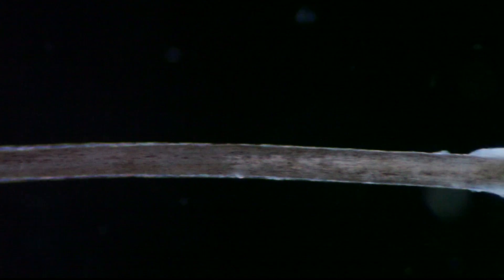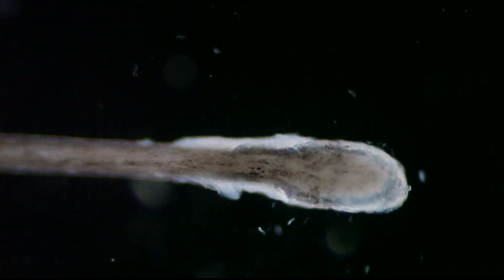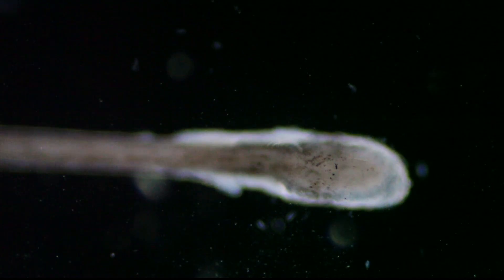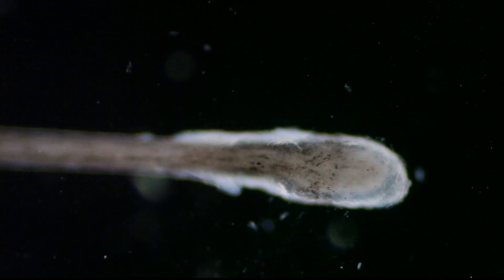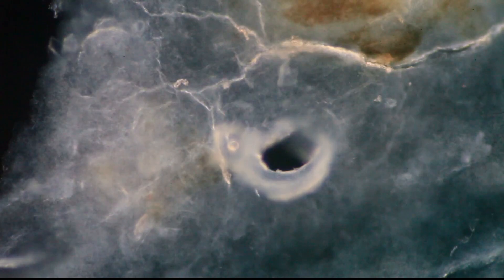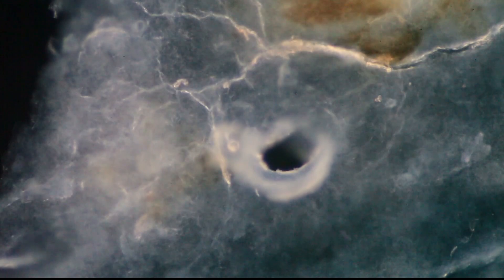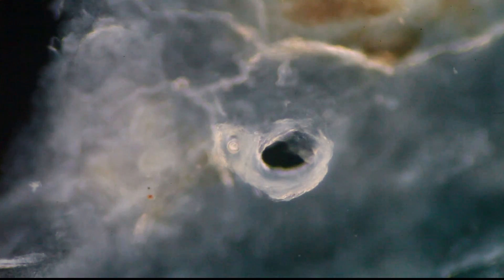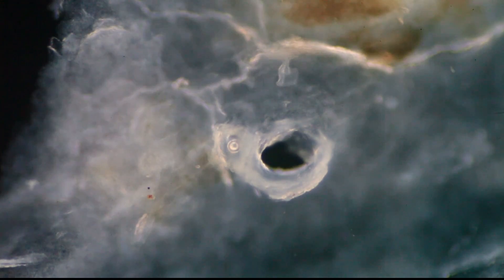Here is another hair, and this bulb-like structure is the hair root. Here is a little hole in a dandruff flake — this is where one of the hairs started to emerge. So what we actually see is the place where hair started to grow out of the scalp. The hair is no longer there — it's been removed — but before mounting it, the hair was actually still in there.